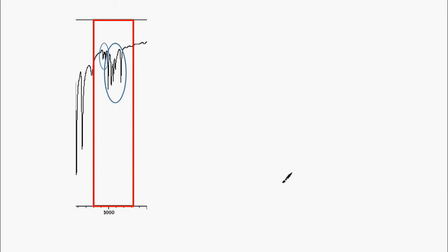So this is very, very common to see both of these together in anything that is an alkene, and we have multiple double bonds and single bonds. Now, we don't know which one it is though, because we need further data. So we can move on to section 3.